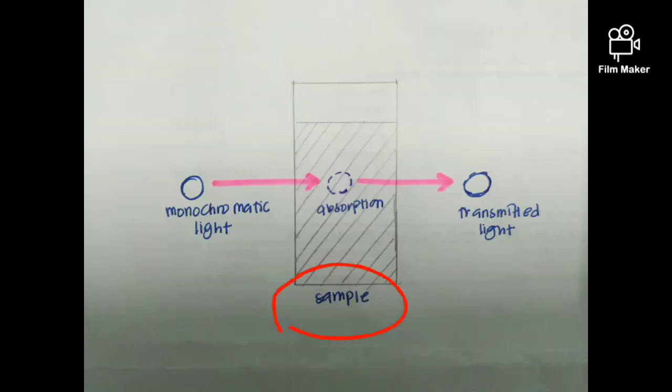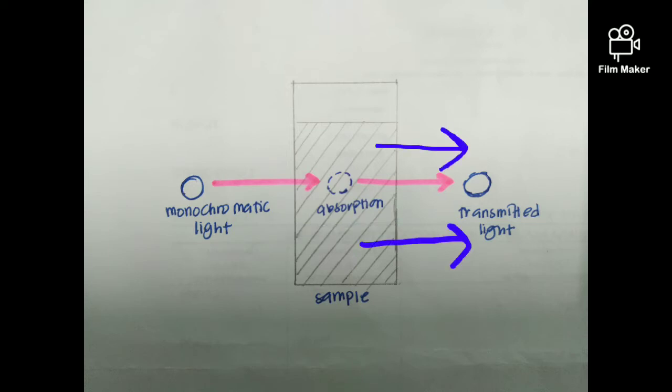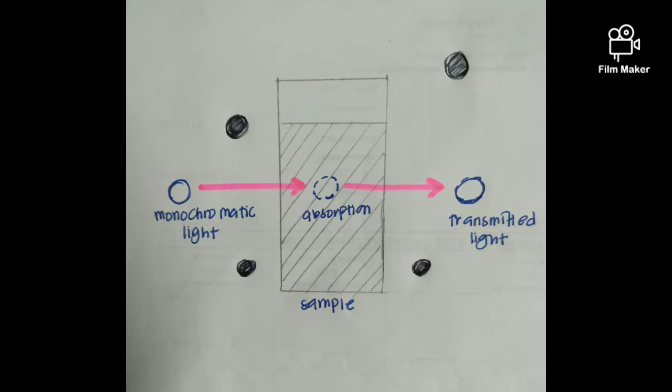Let me explain about the Raman effect and how it can be used in Raman spectroscopy. Firstly, when a sample is exposed to monochromatic light in the visible region, the sample will absorb a major portion of the light and the rest gets transmitted through the sample. However, a minute part of the light will be scattered by the sample in all directions. One can observe the scattering at right angles to the incident beam.